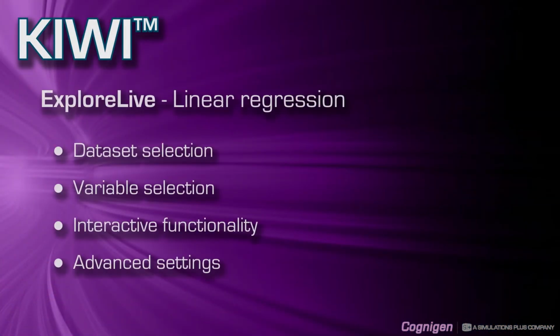In this training video, I will demonstrate how you can perform linear regressions in the KIWI ExploreLive module. I will illustrate how to use basic settings, such as the selection of the data source, the selection of the two variables involved in the linear regression.